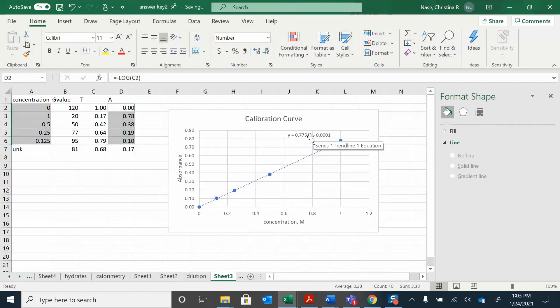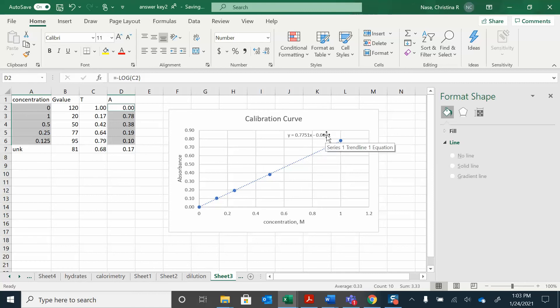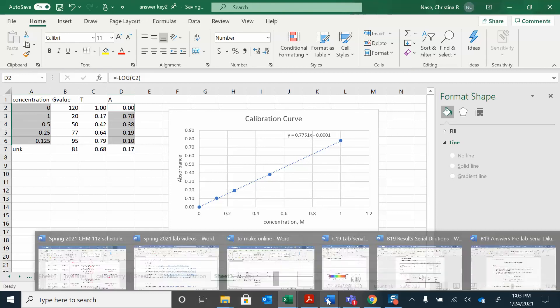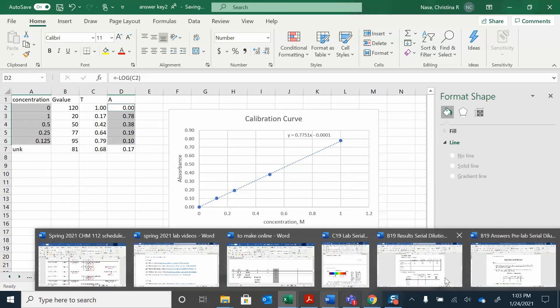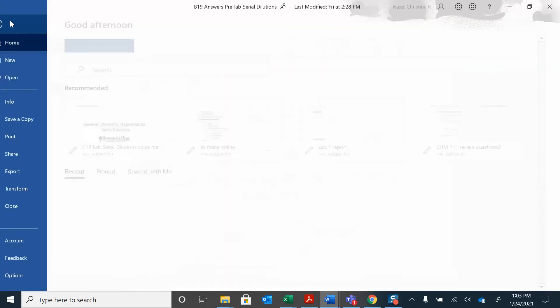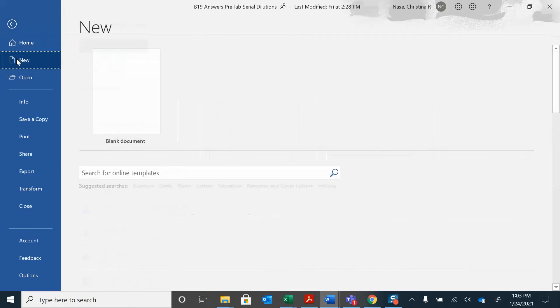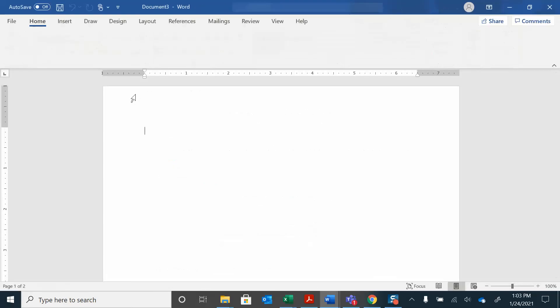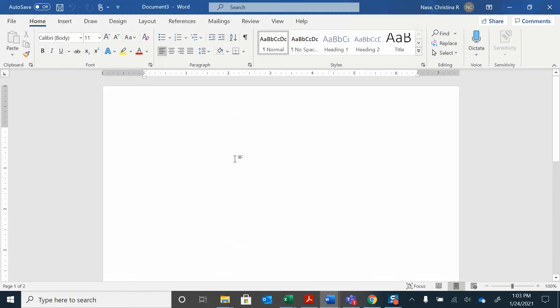So then what do you do? So now that you have your slope over here and your intercept, you can use that to help figure out what the unknown concentration is. So let me get to a blank paper to work that out for you.